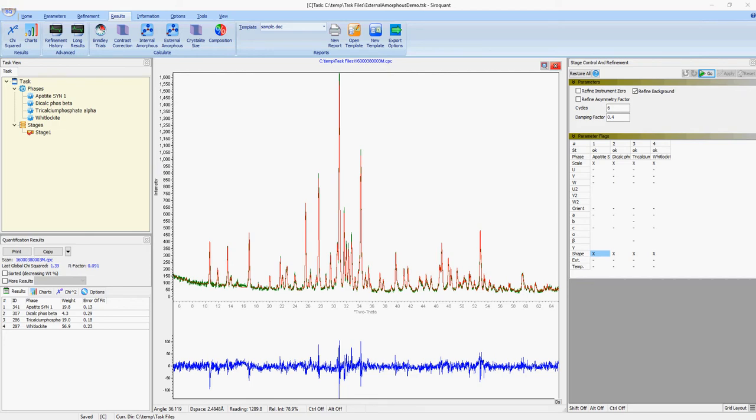Hi and welcome to our tutorial. In this video, we're going to show you how to determine the amorphous content of a sample using the external standard method with Sorokwon software. This is a new feature available in version 4.5 of the software.